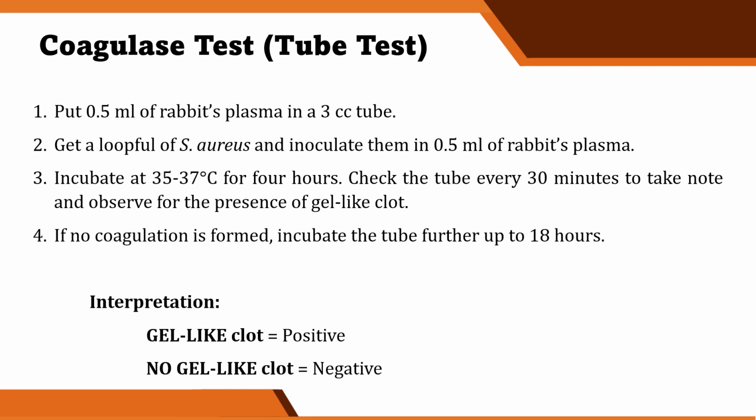So, staphylokinase is also an enzyme present in some strains of Staphylococcus. Okay? So, we need to observe them every 30 minutes kasi may tendency na mag-autolyze or matunaw lang din ulit yung gel-like clot because of the presence of staphylokinase.